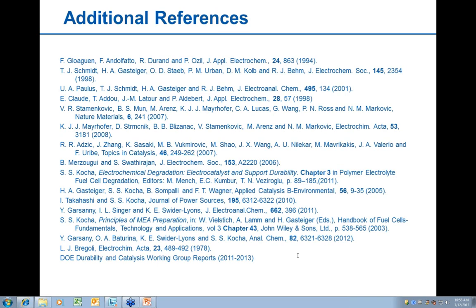In your opinion, what is the maximum allowable time between preparation of catalyst inks and RDE testing? And what kind of difference should be expected between inks tested right away and inks tested, for instance, the following day? Yannick, you want to take that?